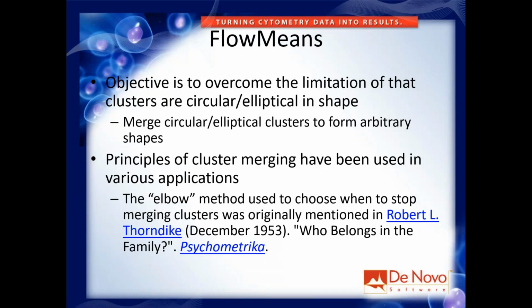So we try to merge them together. And also by merging, it's trying to determine what is the optimal number of clusters to have. So that tries to overcome the limitation that if you ask for 20 clusters, it'll give you 20 clusters. This is really trying to say, okay, I'm going to tell you what is the optimal number of clusters, and I'm going to try and find the shape of those clusters.